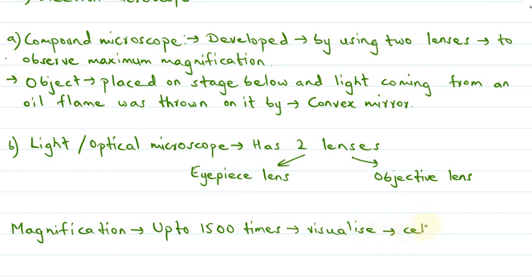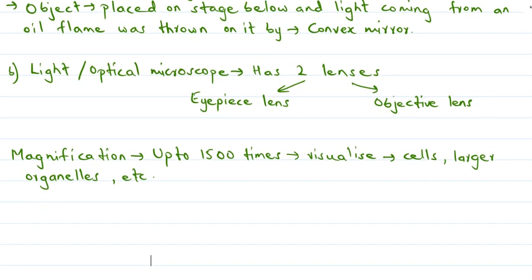The cells, also the larger organelles, etc. Okay, this type of magnification is actually good enough to see the cell's larger organelles, etc.